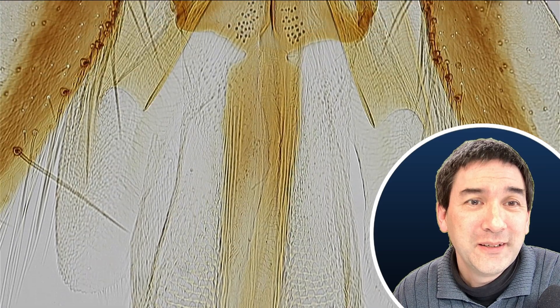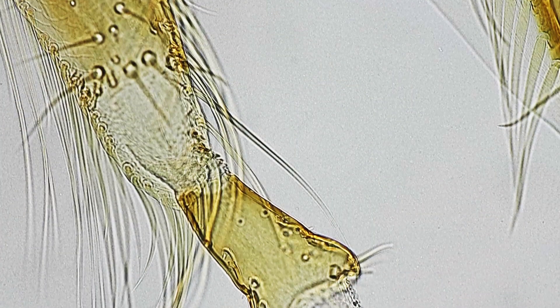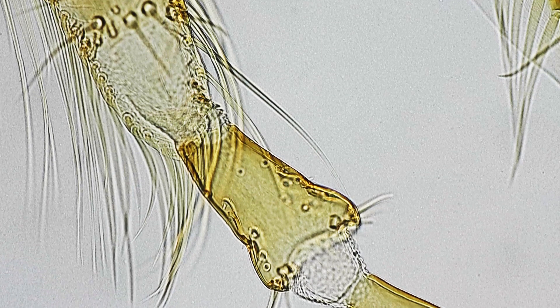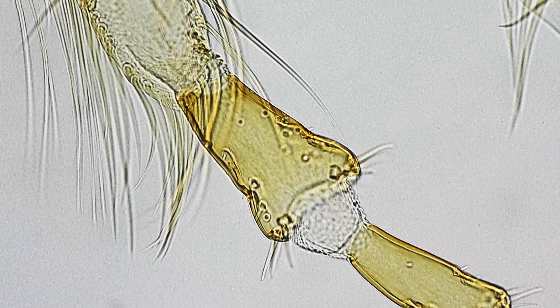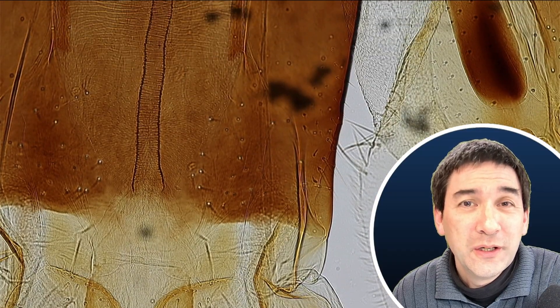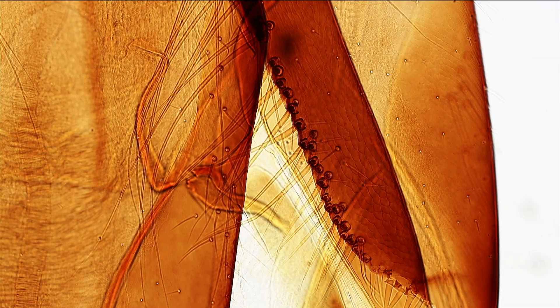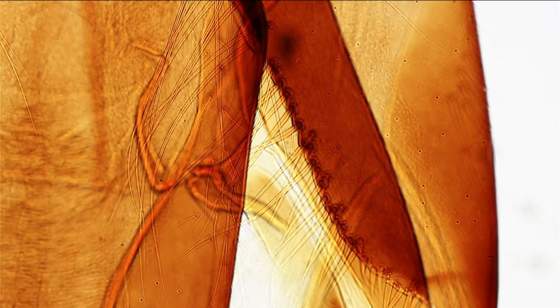Quite nicely visible. It had to be pressed flat during the preparation process, which is why everything is nicely in focus. I do not need to focus very much because everything is in one plane of focus. Some parts here are a little bit thicker in nature. So what could it be? You can pause the video, but I'm going to now reveal and tell you the answer.